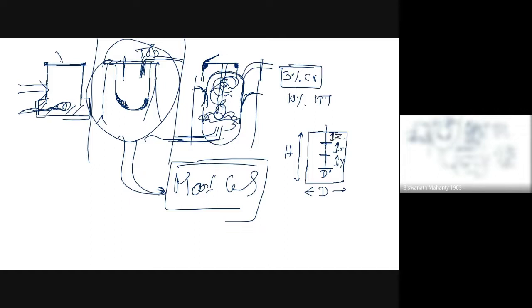Please try to understand, if I am talking about any reactor, whether very small or very big, there is always a dimensional consistency. What do I mean by dimensional consistency? For example, if I want a big reactor, how will I change it? I will change things in proportion. That is very important when I am going for a bigger fermenter. The dimensions are mostly maintained.